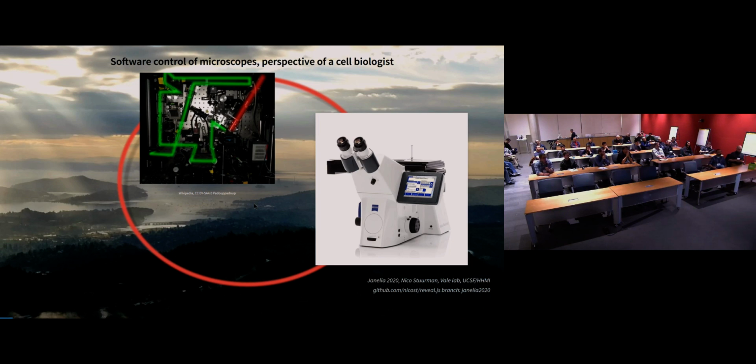The software interface most often will be written by people who just want to make that microscope run and get everything out of it, but are not really directly concerned with bringing that back down to those cell biologists.